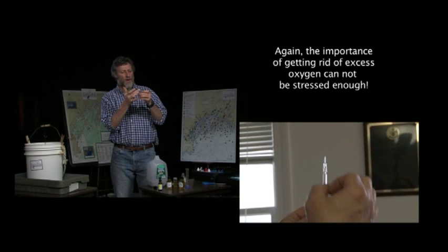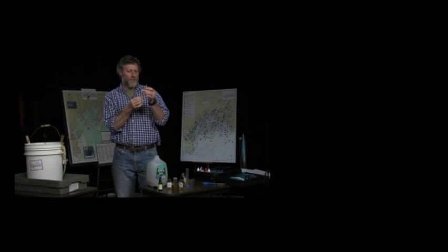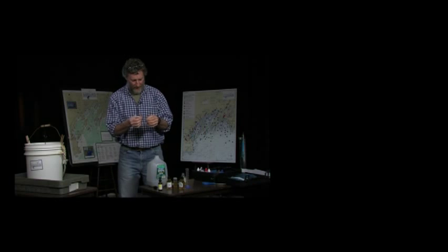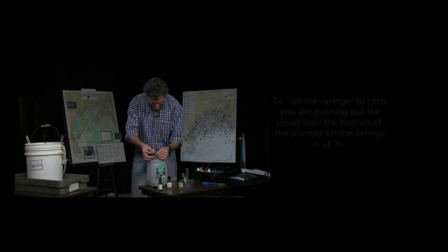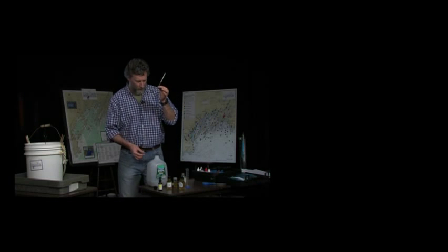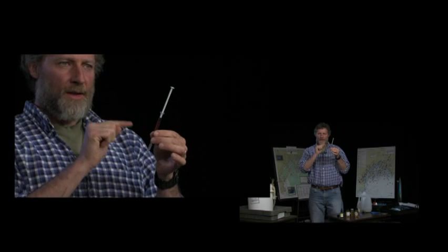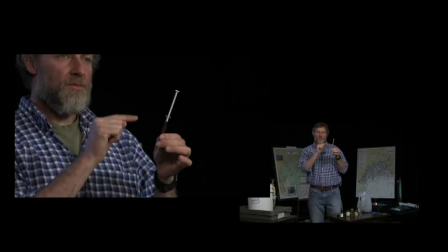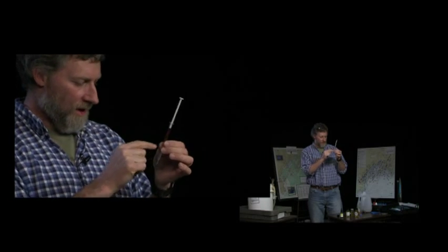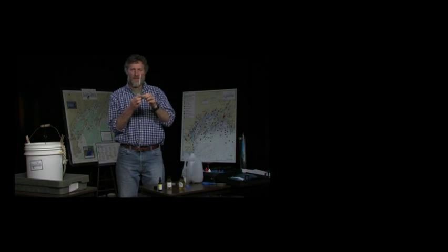When you're confident that there's no air bubbles in the tip and there's no air bubbles on the little plunger on the bottom, what we're going to do now is set the syringe at 0. And we'll set it at 0 like that. Now we have a syringe that's at 0, and we know that every time we add some of the thiosulfate to our sample, we can actually measure how much, because the scale from 0 to 10 will tell us how much we've added. We're going to take this, and this can firmly get put into the top of your titrator tube.